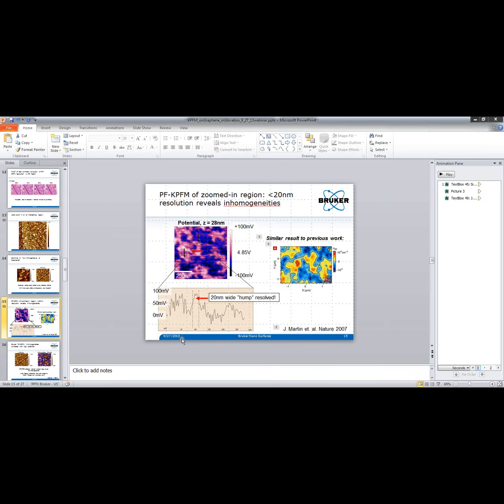Yeah, so I guess specifically, probably one example is you say that you have incredible contrast. How does this compare to basic KPFM compared to the PF KPFM? Well, that's a good question. I did not do that comparison. I did not perform an exhaustive study using every single type of KPFM.